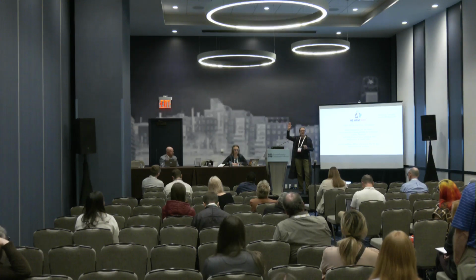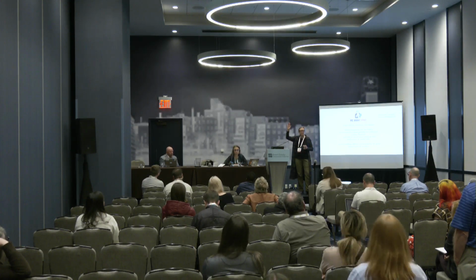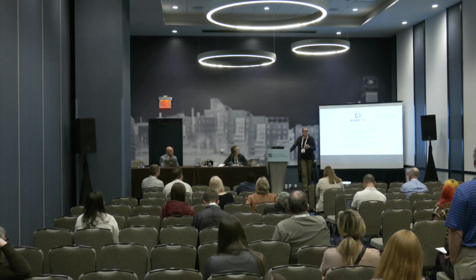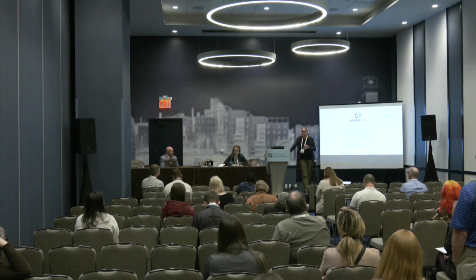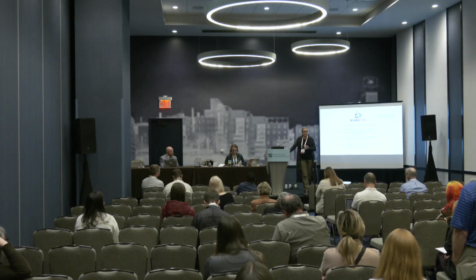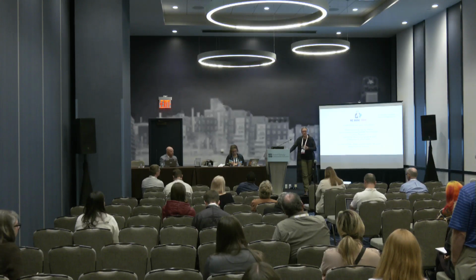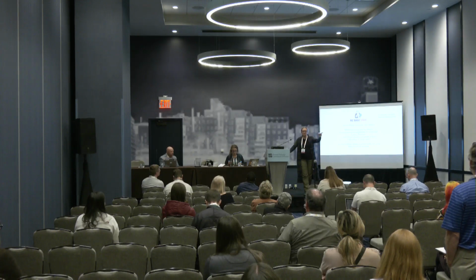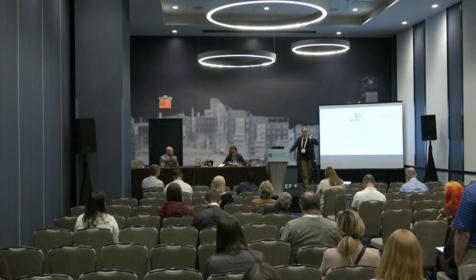So how many instrument manufacturers are in the room? Several, okay. This is absolutely essential, to have persistent identifiers for your instruments. I can't tell you how many times our curators have gone in to try and find a hardware description and it's not there. All of these beautiful shiny machines that are a couple doors down, they're lovely, but tomorrow they could be gone.